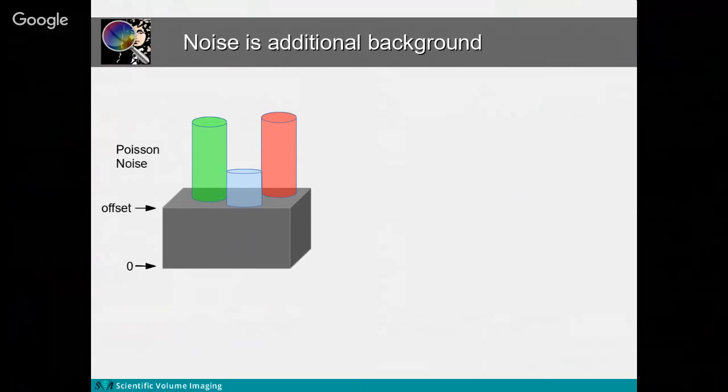This also means that with very low photon counts, the contribution of noise to the image buildup becomes significant and will hamper object recognition in raw data. Luckily, with the help of deconvolution algorithms and the point spread function, we can better distinguish real signal from noise. Key to this is determining the correct background setting. A too high setting will remove noise, but also real signal.